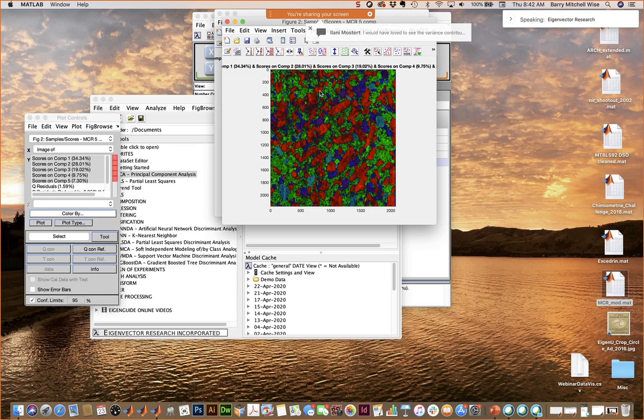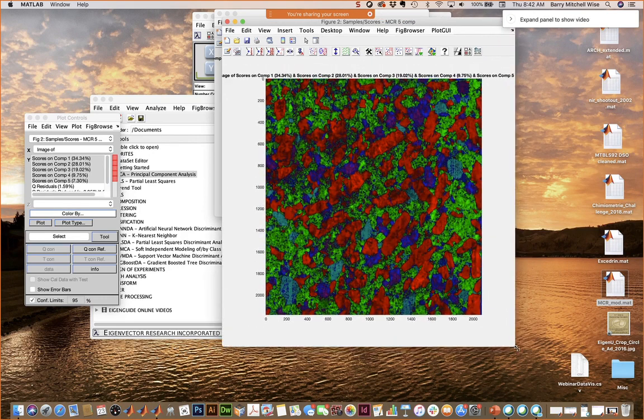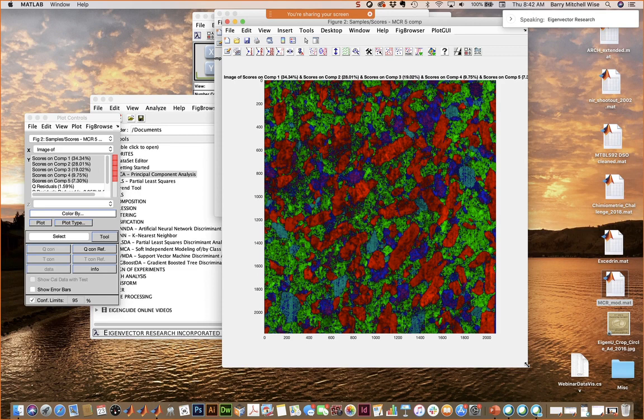Whoa, the MCR image looks crisp. How can you enhance the images? Yeah, I Photoshop, I guess. If you want to do post processing, I'm not exactly sure what all you're asking on that, what else you might like to do on it.